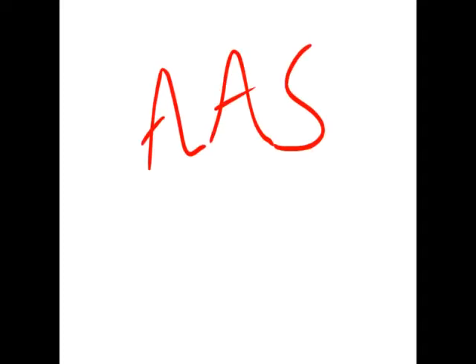Good morning, students. So in this video we will deal with the topic called atomic absorption spectroscopy. This technique is similar to flame photometry. It is also called AAS.